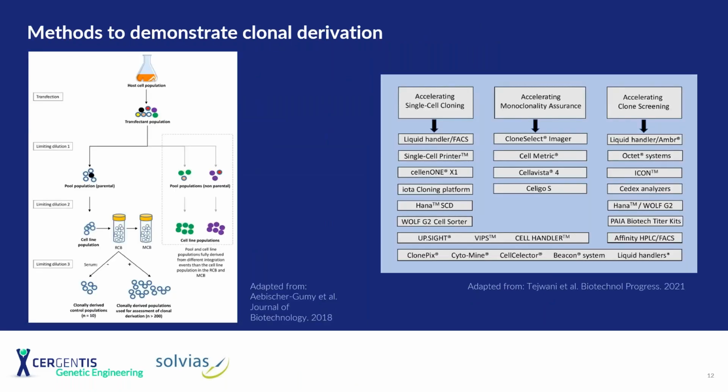If we move forward and we talk about the clonality, both industry and regulators want to ensure consistency and quality of biological therapeutics, and therefore their manufacturing process. And according to officials, one critical criteria here is to assure clonality. So clonality assurance is needed to minimize the heterogeneity of cell banks and therefore favor a consistent process to manufacture a product. And in fact, the FDA and EMA in their guidelines both explicitly indicated that biologic products should be derived from a single cell progenitor or monoclonal cell line.